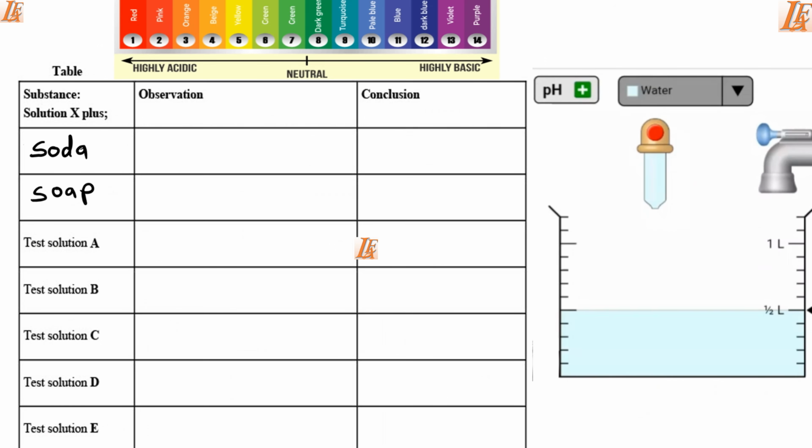So just like another lab, it's very important for us to know the setup of our apparatus, where the chemicals are, where the apparatus are, so that we avoid accidents and injuries. In this case, we're going to begin with the upper side, where we have a chart with very many colors. This is what we call a pH chart.